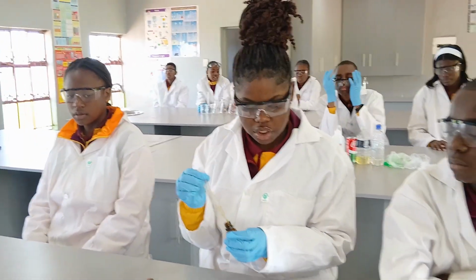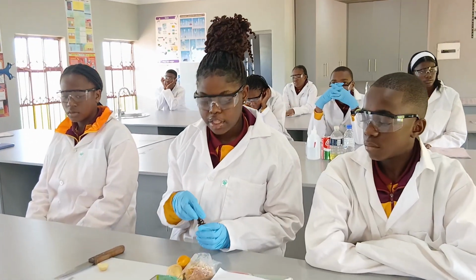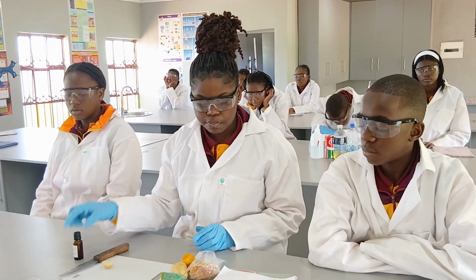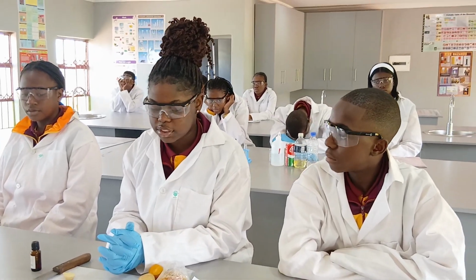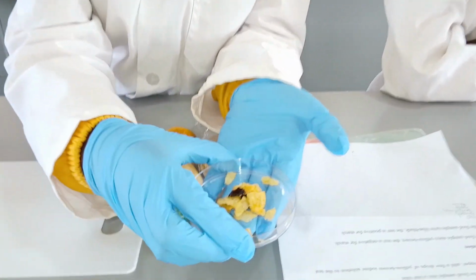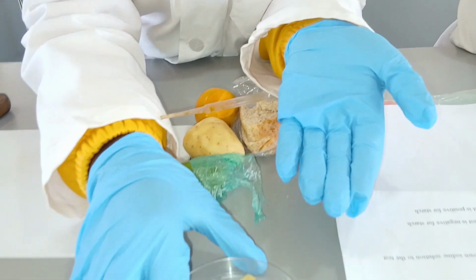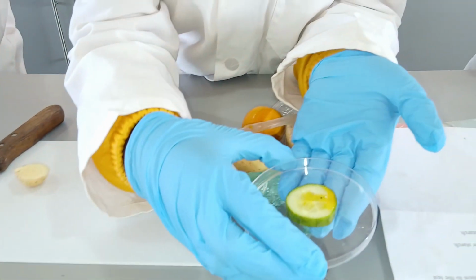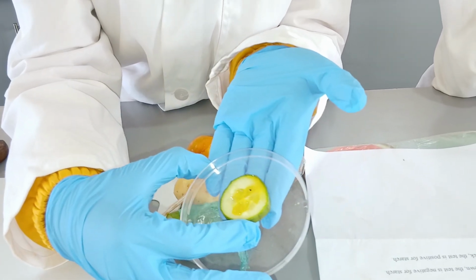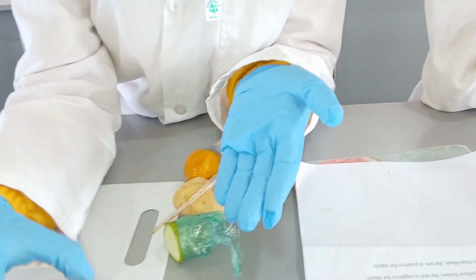For the observation, if the food sample stays yellow-brown, the test is negative for starch. If the food sample turns blue-black, the test is positive for starch. So here, for the observation, we are going to notice that this food has turned blue-black, and the cucumber has not changed its color, or it has changed a bit, but the color is not blue, which means that there's absence of starch.